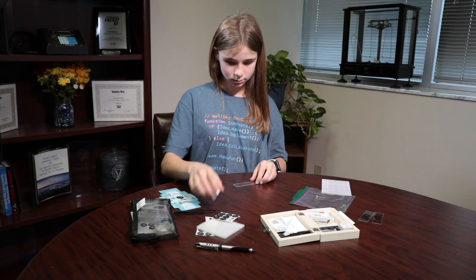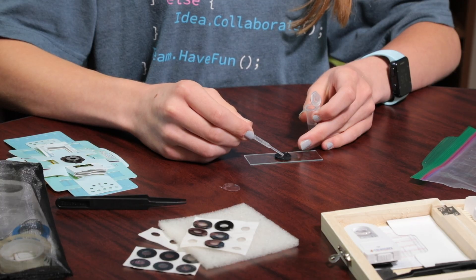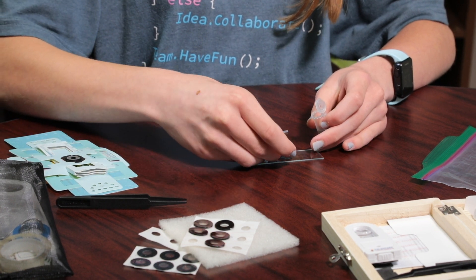Use a glass slide and thicker ring sticker to create a well for your water sample, and use a pipette to fill it almost to the top. Use the cover of the ring sticker to seal in the water.